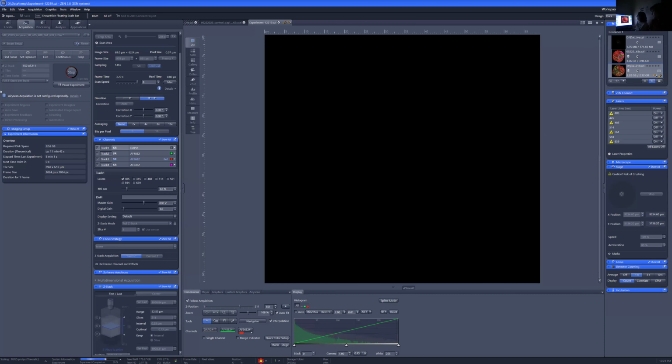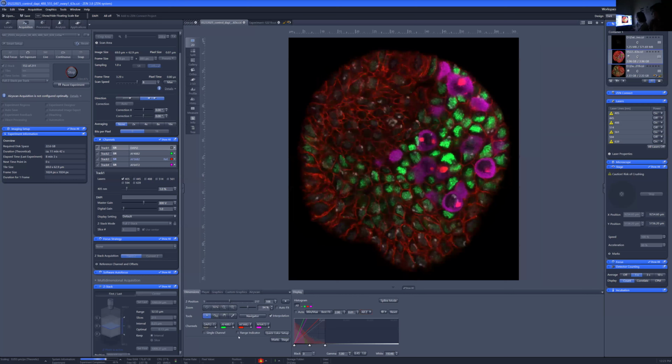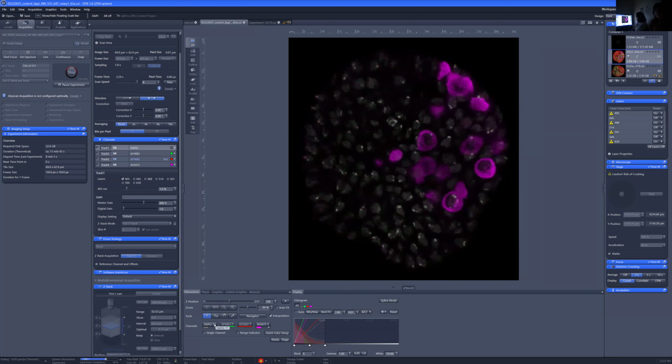So basically, if I go back to this image that has already been completed, the one that we already took, I feed these images into a computer program that basically correctly identifies this as an egg stem cell and this as an egg stem cell, but won't catch any of these other non-stem cells that are just in gray. And it can do this really, really quickly, and it can do it way more accurately than I can.